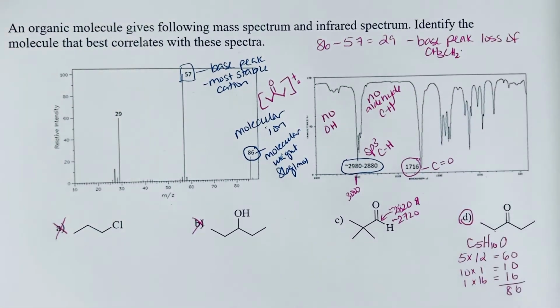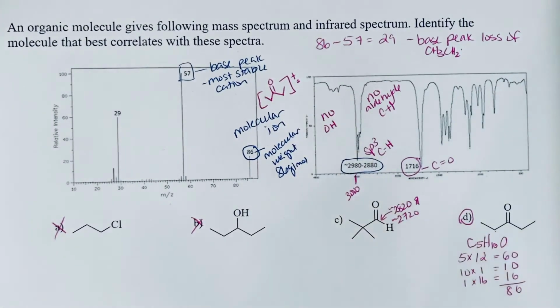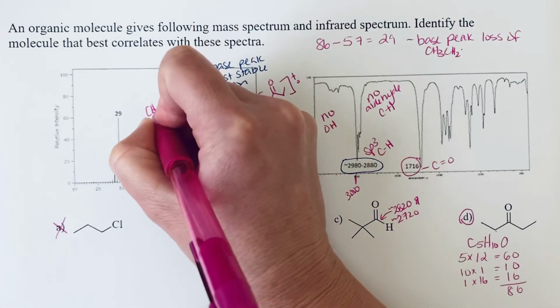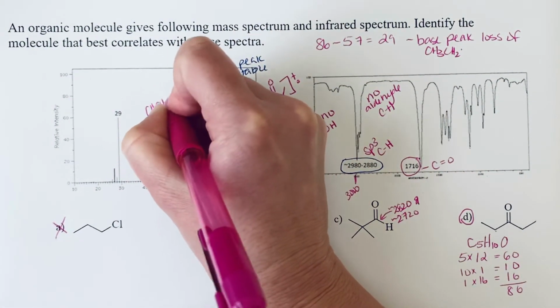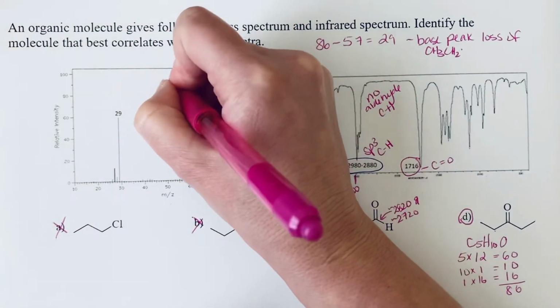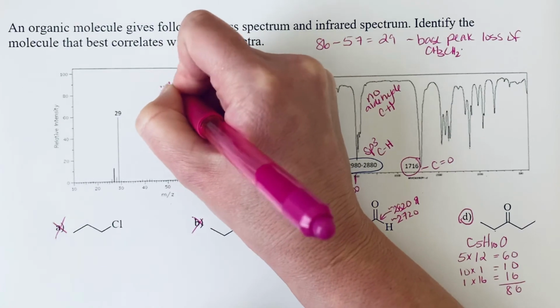That's exactly what we would expect from this ketone. We tend to see alpha cleavage from carbonyls. If one of those ethyl groups cleaved off, we would get this cation, which is resonance stabilized.